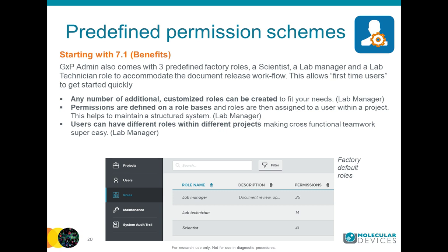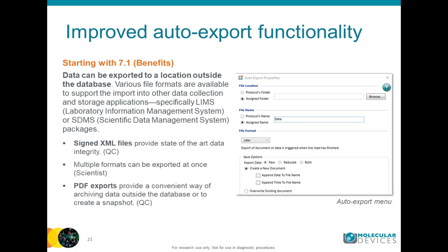For our more experienced users, we offer the opportunity to create new roles as well as to modify the factory roles if this is desired.